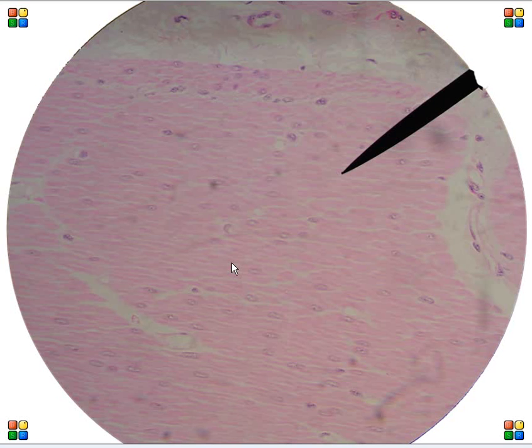And that's smooth muscle. So we've been through skeletal muscle, cardiac, and smooth. Thank you again for watching.